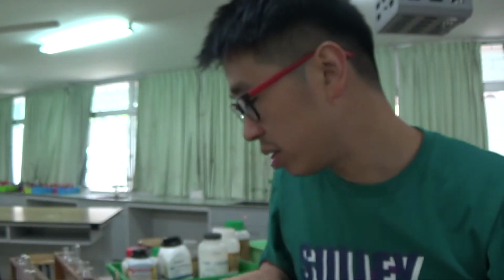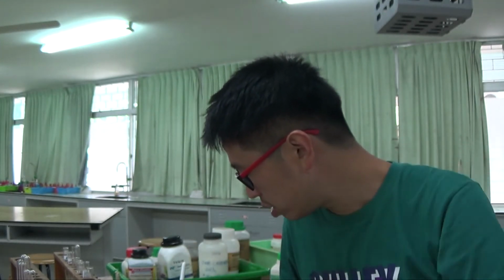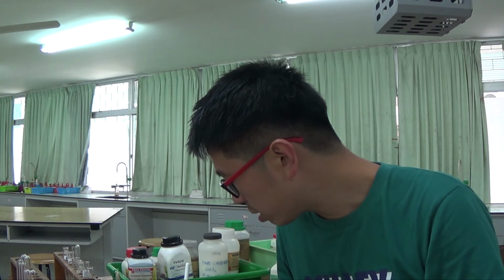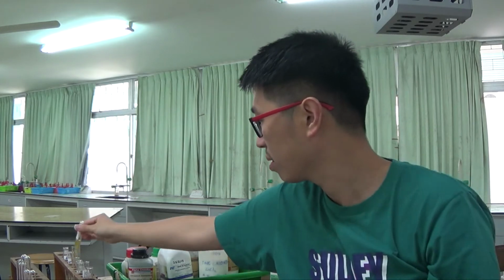So the precipitate itself is actually insoluble, because you still have it lingering around in the end. So this is what you call insoluble. Whereas some students at the beginning of their qualitative analysis would have thought that this is soluble, when you could still see the precipitate. It doesn't go away in excess NH3 even if I shake it.